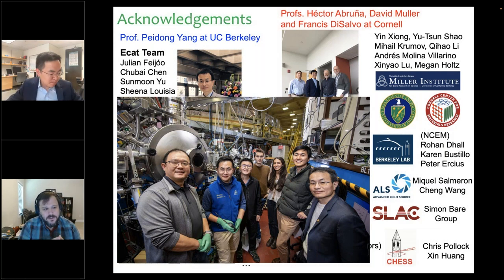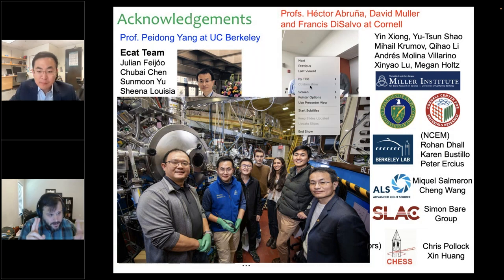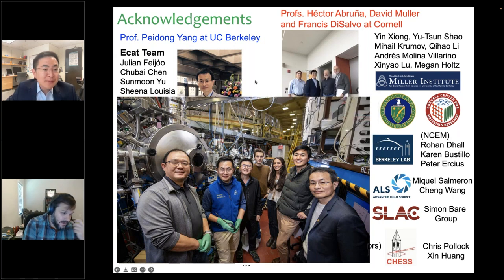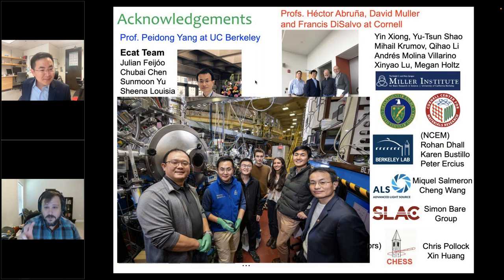So the first question, I'm going to read this verbatim. I understand the elegance of using a hydrogen bubble to decrease the thickness of the liquid layer, but in reality, you want to minimize the formation of hydrogen gas. How does the hydrogen bubble formation influence the comparison of the catalytic results between the operando TEM and the ex situ real life experiments? Yeah, I think that is the question we have in mind all the time.